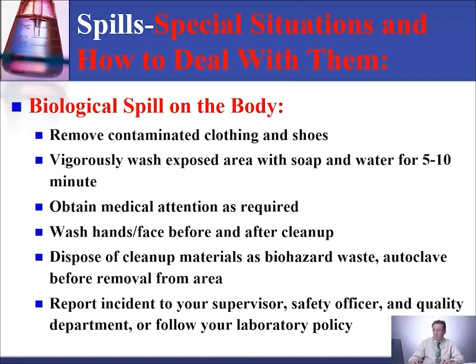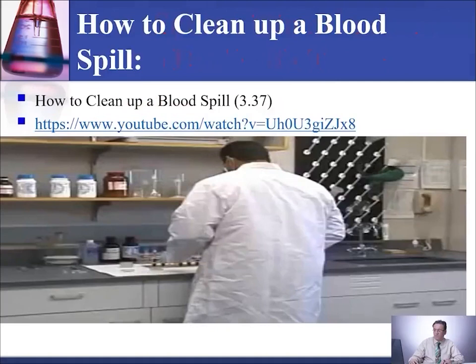Report the incident to your supervisor, safety officer, or quality department, or follow your laboratory or institution policy. I have a video here for you on how to clean up a blood spill, if you'd like to watch it.